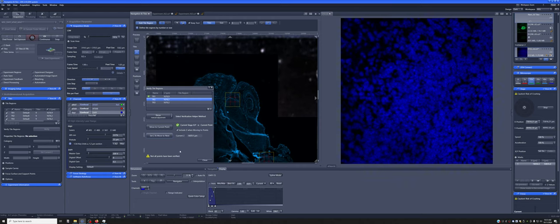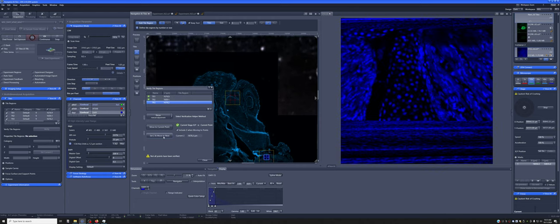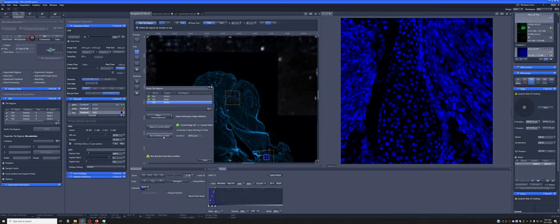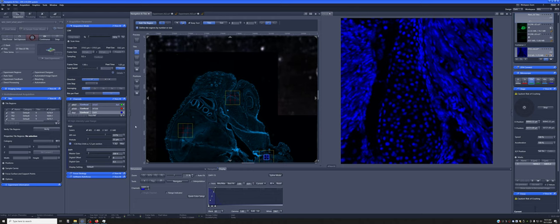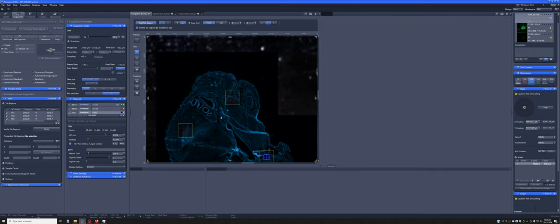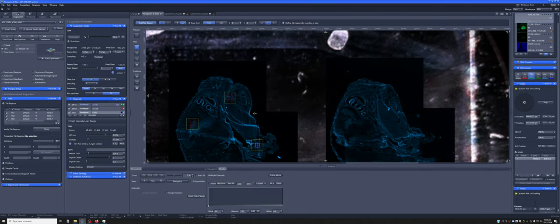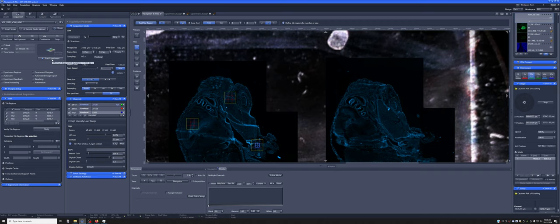Now that looks better. Set Z and move to next. And this one actually looks fine. So I'm going to say set Z and move to next. All points have been verified. I can close this. Stop that. So I know that the focus is correct on all of them.